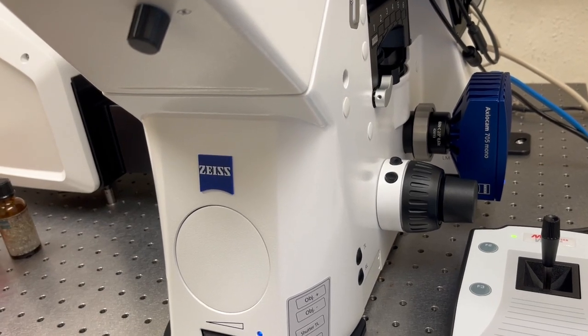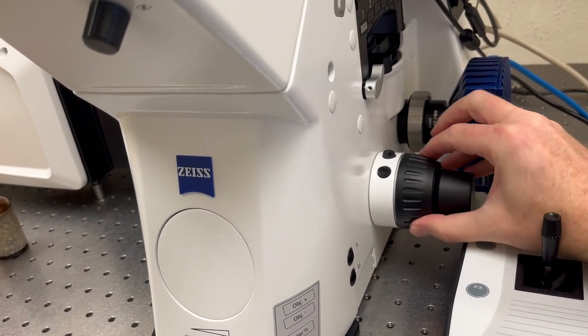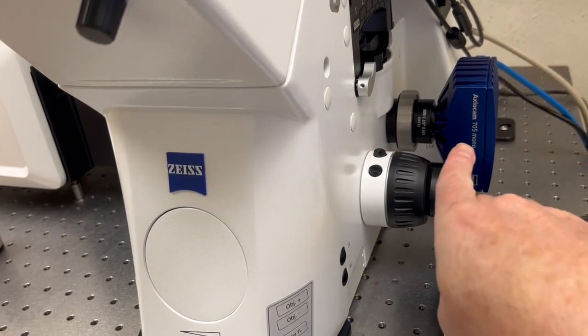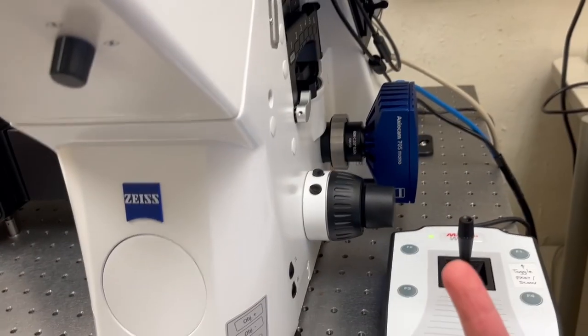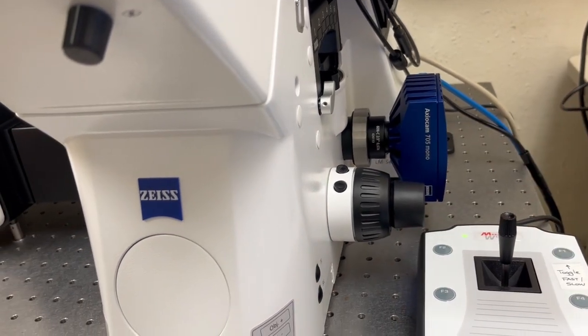Because this is a German microscope, in German microscopes if you rotate the knob away from you towards the wall, that moves the objective up, whereas if you rotate it towards you that moves the objective down.